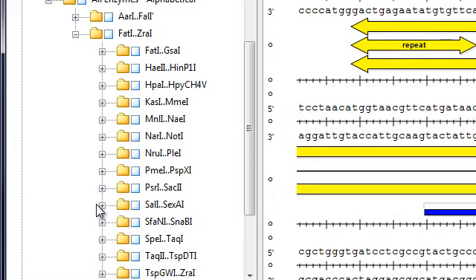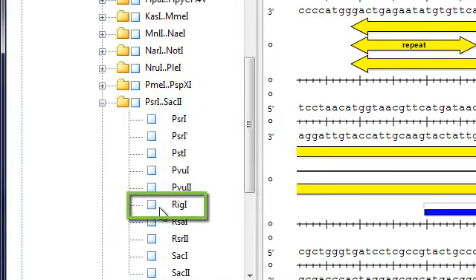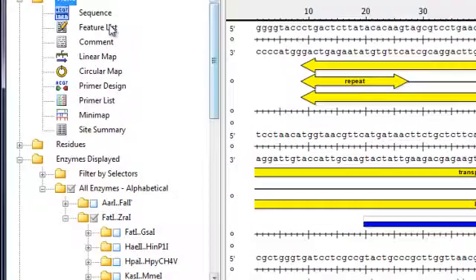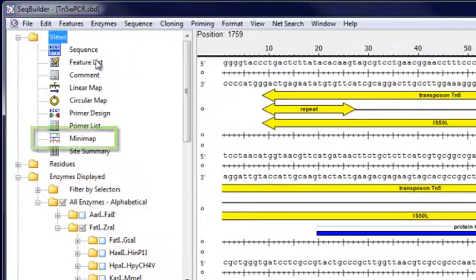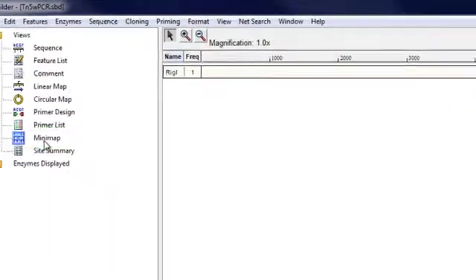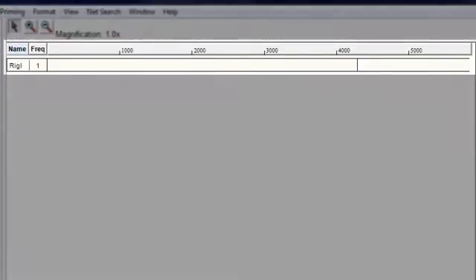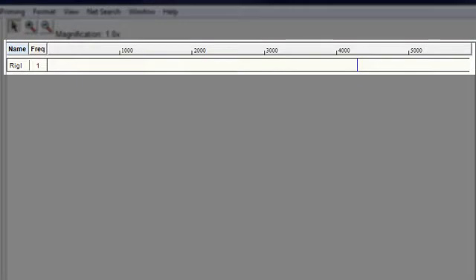So we can drill down through this alphabetical list to locate the enzyme and apply it. And I'm going to switch to the minimap so we can see where the enzyme cut site is. You'll notice that this particular enzyme cuts on my sequence once.